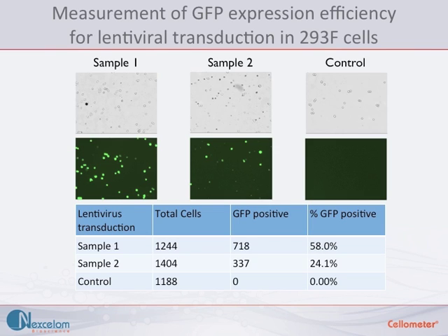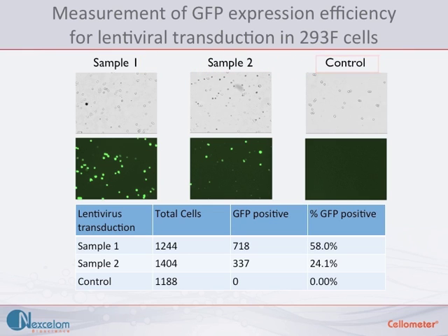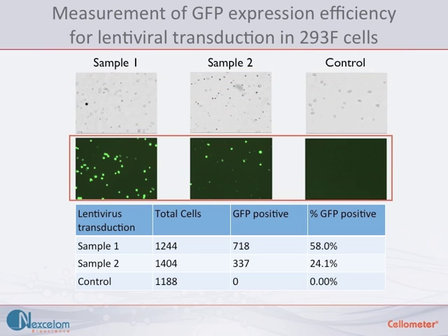Here we are looking at GFP expression efficiency for a lentiviral transduction in HEK-293 cells. Three data points were collected for this experiment: sample 1, sample 2, and a control. The micrographs for each sample show a brightfield image and a corresponding fluorescent image. The captured images were analyzed and the results are displayed below. In sample 1, 58% of the cells are GFP positive.